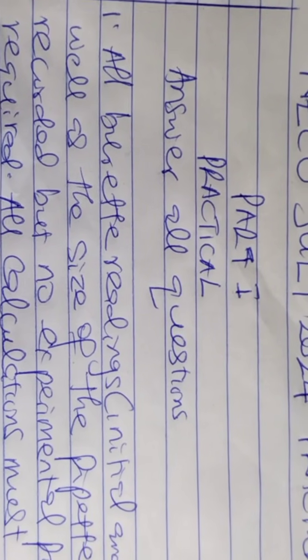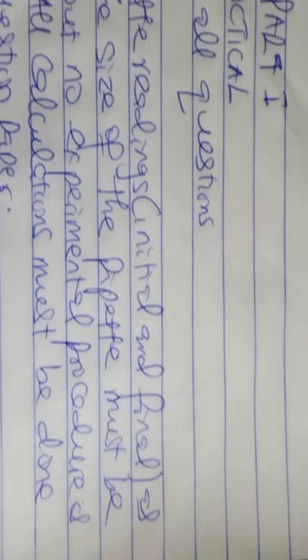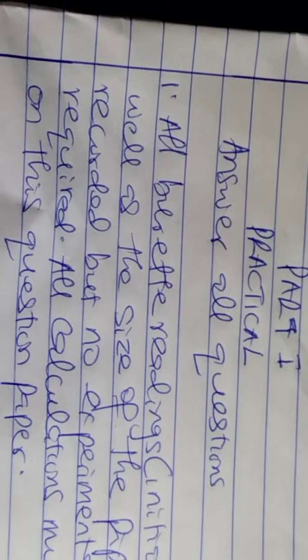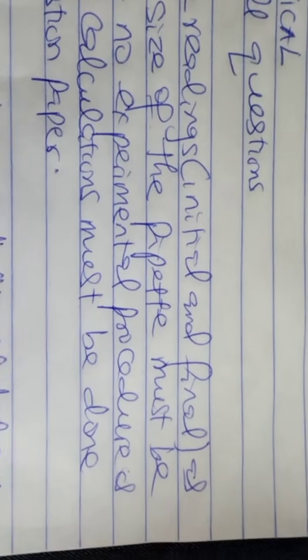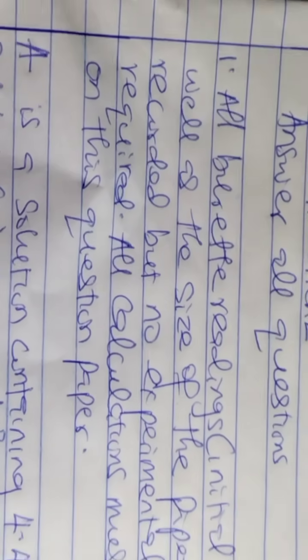Practical. Answer all questions. 1. All burette readings, initial and final, as well as the size of the pipette, must be recorded, but no experimental procedure is required. All calculations must be done on this question paper.